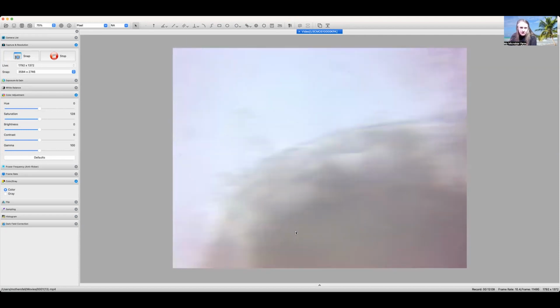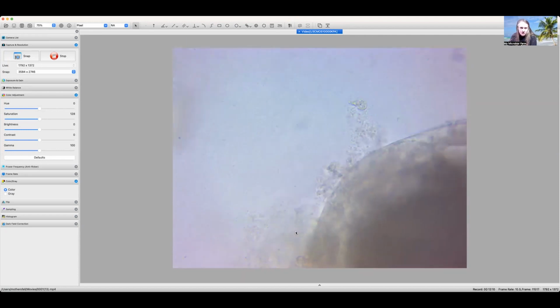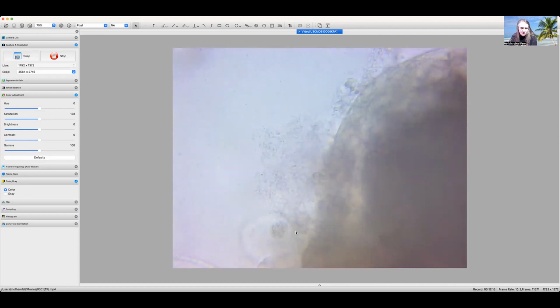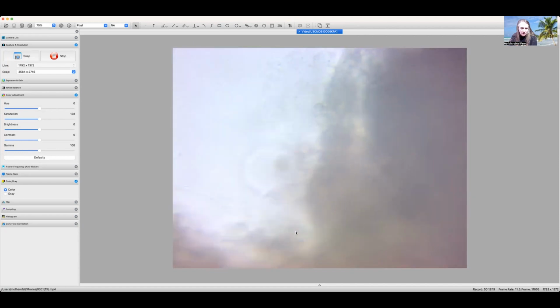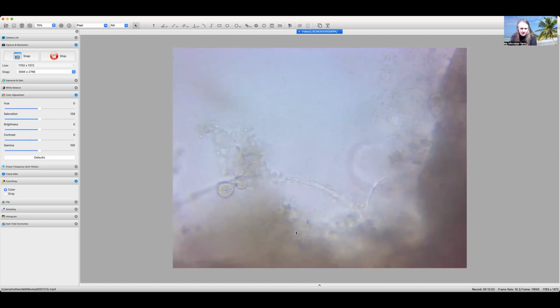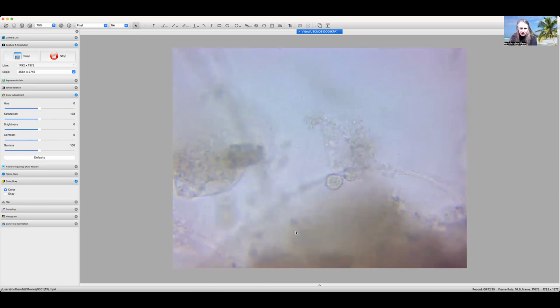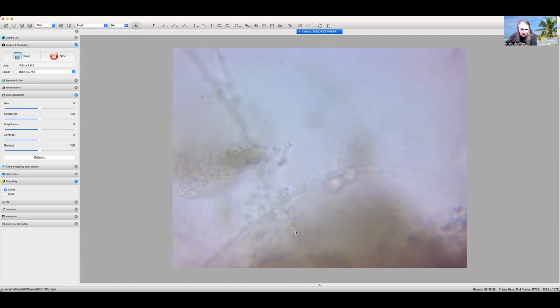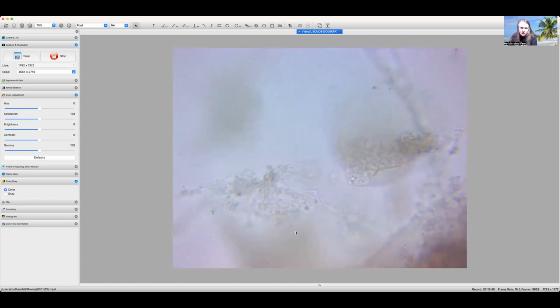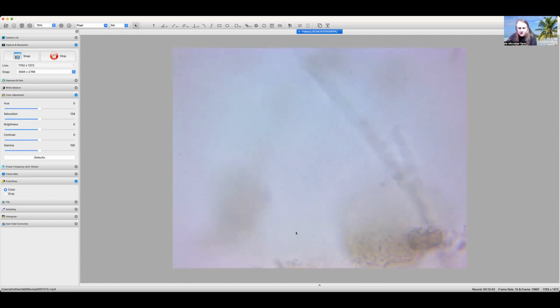And then living all around this white structure, and I can't get into the white structure to see what it is, but it has all these things around it living with it. So obviously that's an amoeba. There's lots of amoebas here. And then if you see these hair-like appendages coming off of here, these are fungal hyphae. Some of these are a little bit clogged with bacteria, but I'm gonna keep looking here because I found some really good ones out here that you could see the septa.